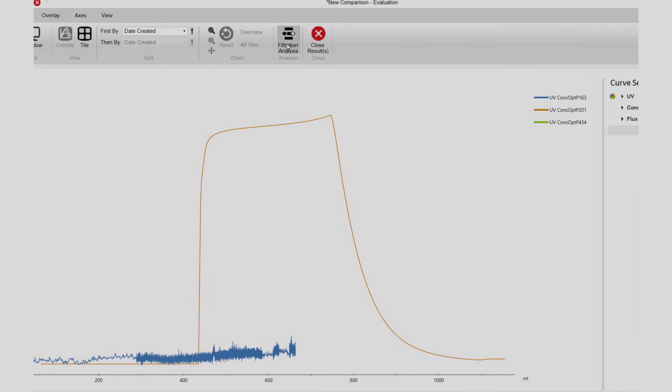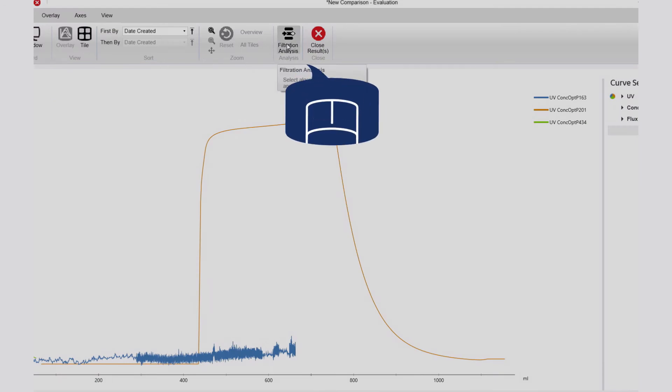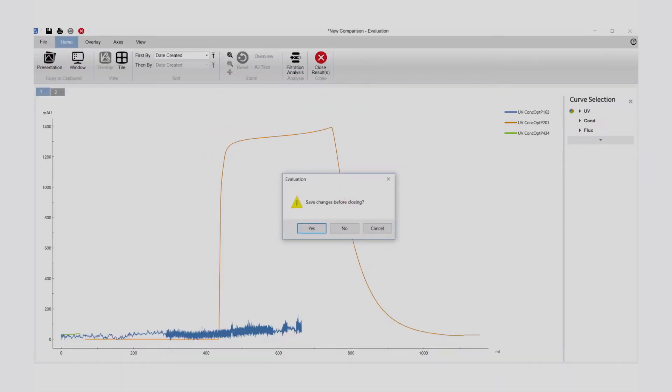To start the analysis, click on Filtration Analysis. In the pop-up window, you can select your choice and continue with the analysis.